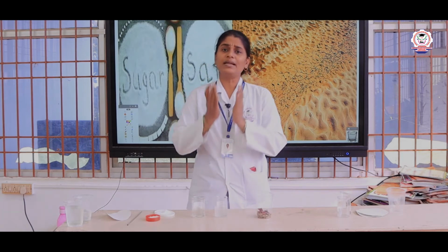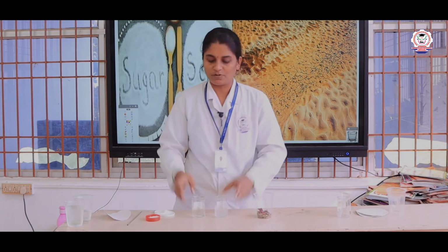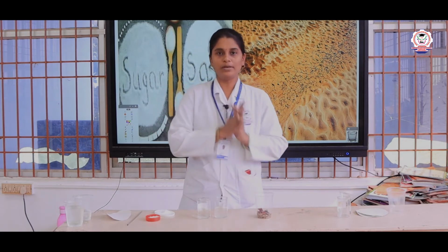Now, how can we separate the soluble impurities from this water? We have methods known as evaporation, and with the help of the distillation process we can easily separate the water and the soluble impurities. Now, I am going to show you what the insoluble impurities are.